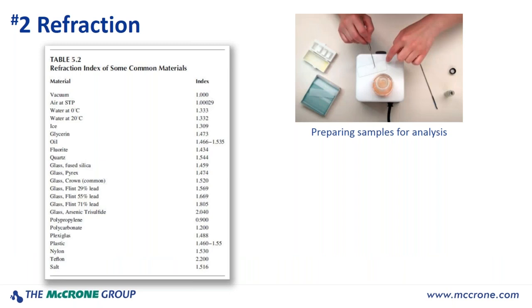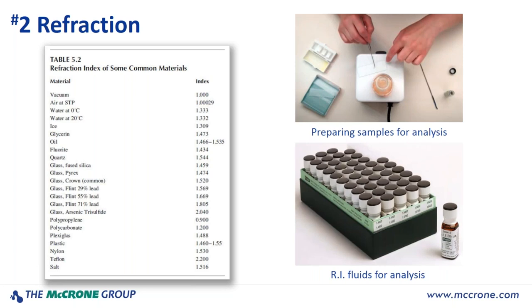The refractive index is an important characteristic used to identify particles. Although not unique, it can be used to narrow the possible choices down to a manageable number. Particles can have 1, 2, or 3 refractive indices depending upon the morphology. Determining the exact refractive index of a particle using refractive index liquids can be time-consuming. Making slides using many refractive index fluids to methodically bracket the refractive index, up to 3, takes time.